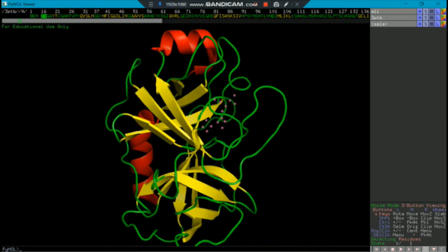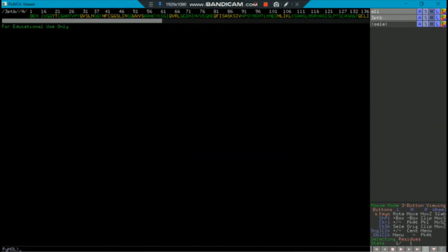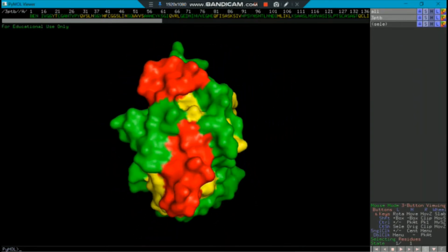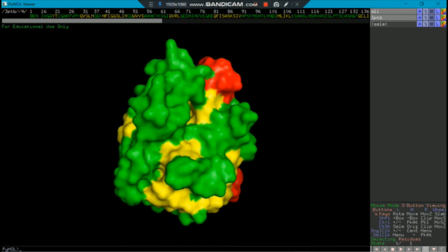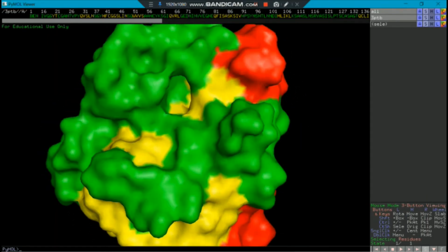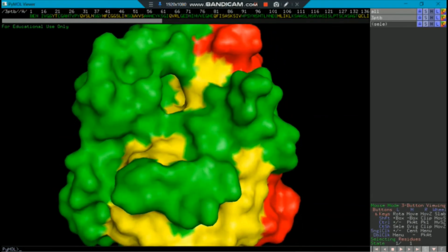Afterwards, for only the 3-PTB molecule, I repeat, you have to hide everything, and then show it as cartoon or a surface. So this is the surface representation for our 3-PTB trypsin molecule. Let us identify the binding site. This is the probable binding site which we saw earlier, but I think it is quite shallow, not too deep. And above it, we have another possible binding site.